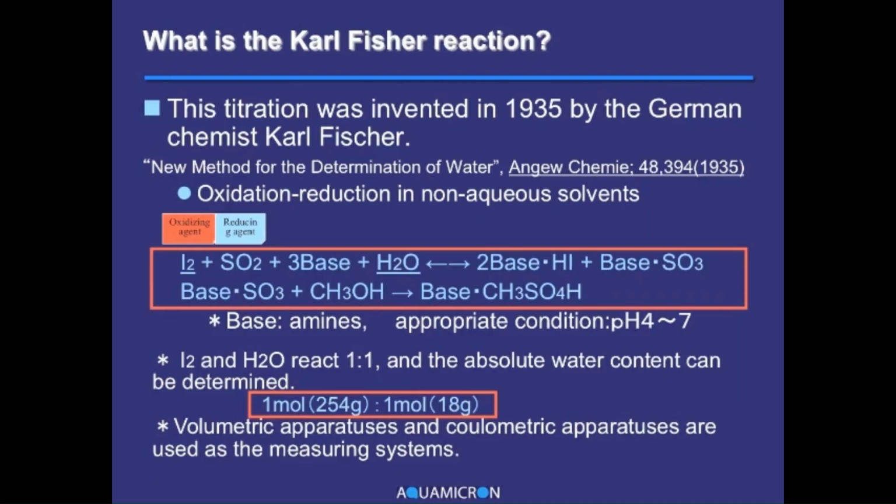After further investigation, two methods of Karl Fischer titrations were developed and are used now. One is called volumetric titration, and the other is coulometric titration. I will describe them both in detail in the following slides.